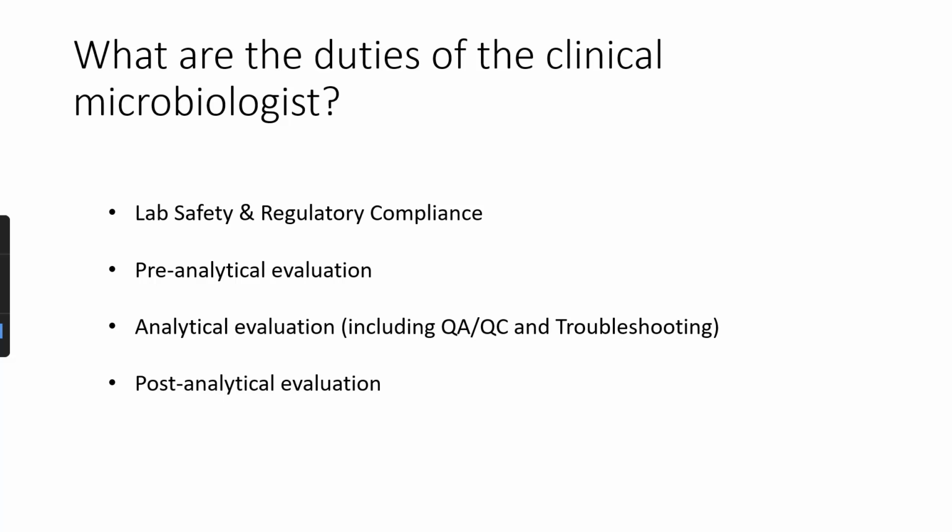Regulatory compliance means making sure your lab area is in compliance with all sorts of governing agencies so that we report out results that do not have errors in them. So keeping a safe environment, making sure all of our media is up to date and not expired, and that we are cleaning appropriately so there's no contamination in our cultures, all of those practices we will cover extensively in this course.